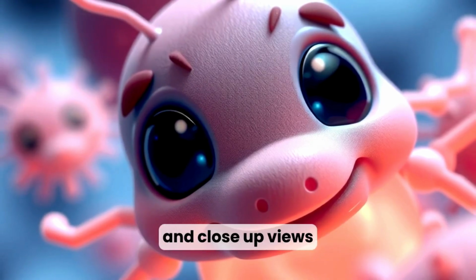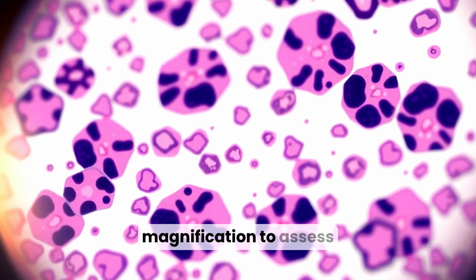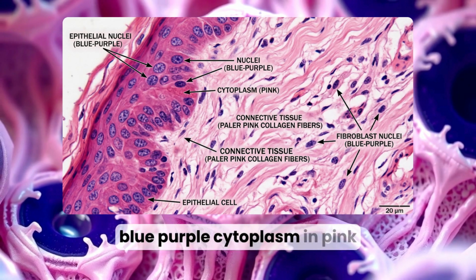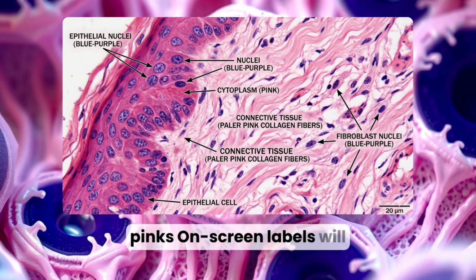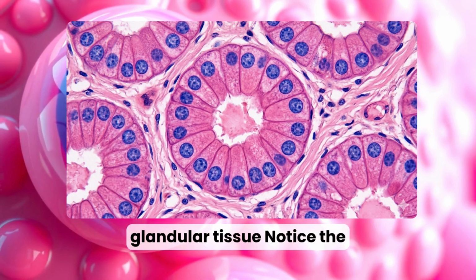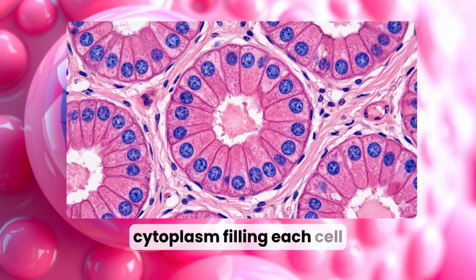When approaching an H&E slide, start at low magnification to assess overall architecture, then move to higher power for cellular detail. Look for labeled nuclei in blue-purple, cytoplasm in pink, and connective tissue in paler pinks. On-screen labels will highlight these features as we examine examples. Here is a close-up of glandular tissue. Notice the blue nuclei lining the glandular cells and the pink cytoplasm filling each cell.